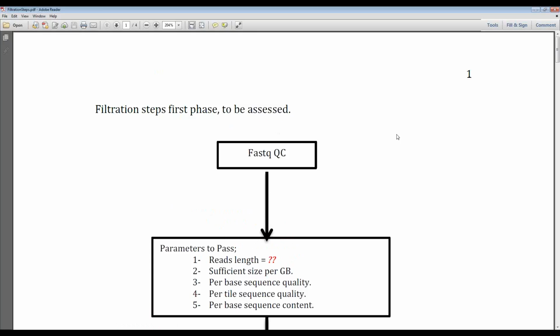Recently, we only outsource the wet part of the exome sequencing to a commercial laboratory, and then we receive the raw data files, which could be compressed FASTQ, BAM file, or down to the VCF file. And what you can see on my screen is a customized filtration process that has been implemented in our laboratory for VCF file analysis.